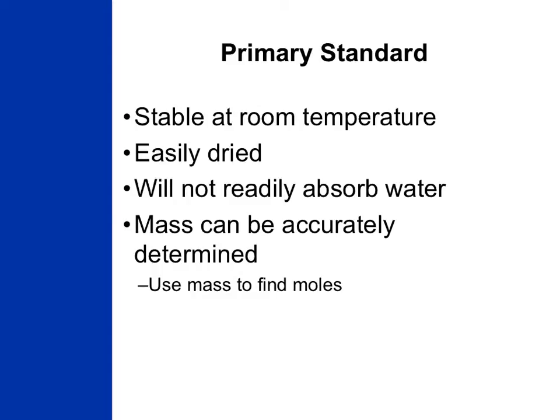When determining mass, we consider accurate to be out to the plus or minus 0.0001 grams or 0.1 milligrams. This is where it becomes important that you write down all of the values from the balance into your lab notebook and report all of the numbers when you're doing your calculations. We will then use mass and our knowledge of stoichiometry to convert from mass to moles.